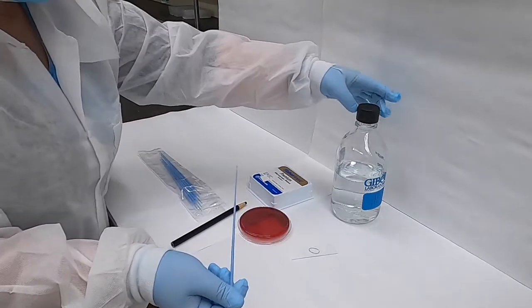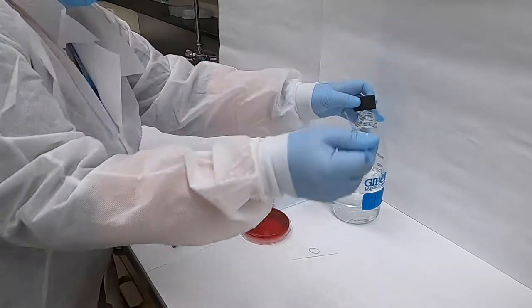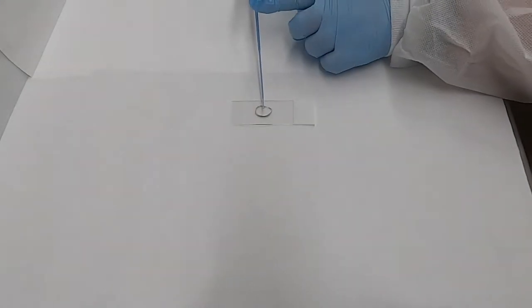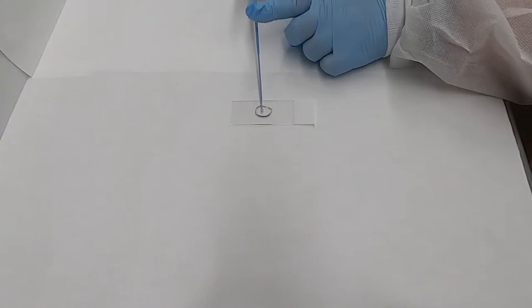Use a calibrated loop to collect a small amount of water which we're going to deposit into that circle by gently tapping the loop.